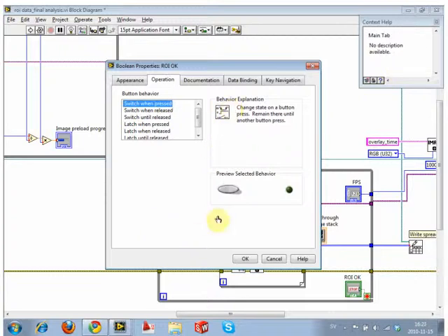If some of your buttons are wired like this, and sometimes they have to be, like if you want a loop to keep running, or you want it to keep going from location to location, you don't always want it to latch when you push it, and you don't want it to be a single point. You actually want it to stay on until you finish, and then you want it to switch off. What we're doing here is, we can actually leave it in this mode because I know I clean it up.